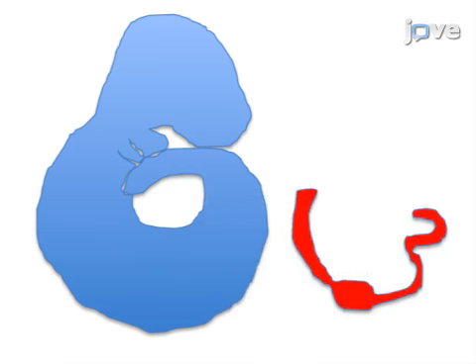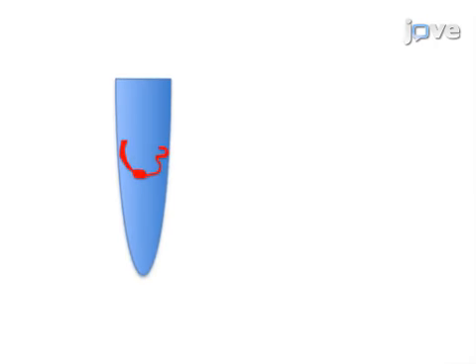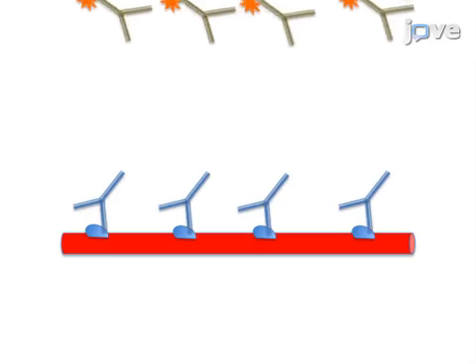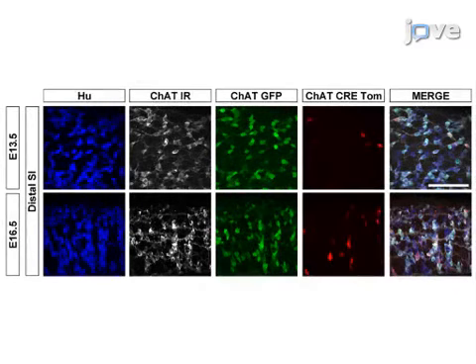Next, the GI tract can be stored in 30% sucrose solution until multiple samples are ready for processing. The final step is immunostaining with primary antibodies to the neurotransmitters of interest and fluorophore-conjugated secondary antibodies for visualization. Ultimately, confocal microscopy is used to visualize the immunostained gastrointestinal tract.